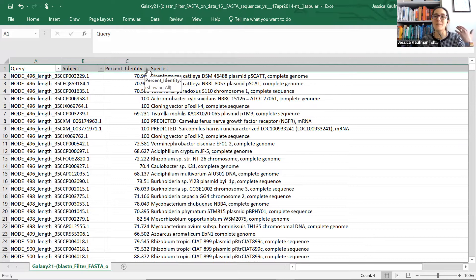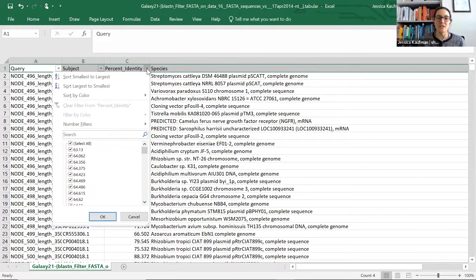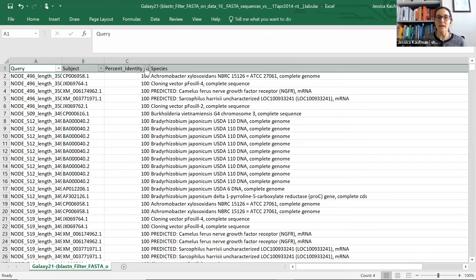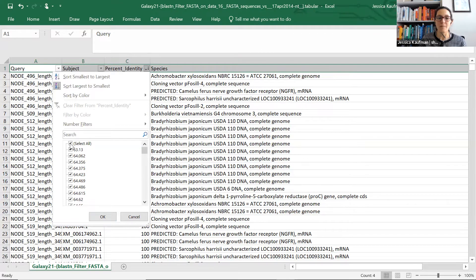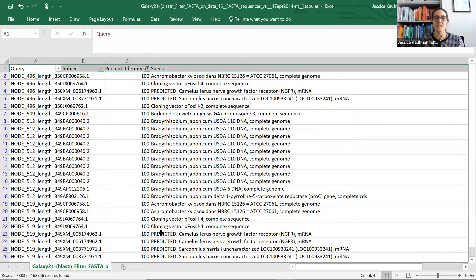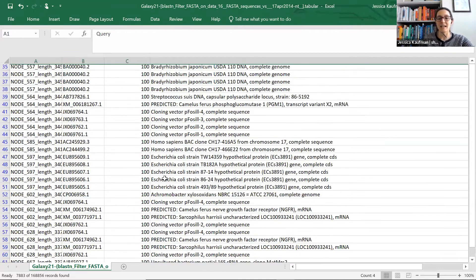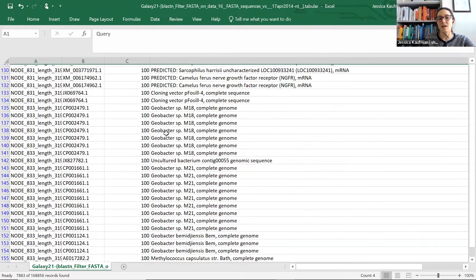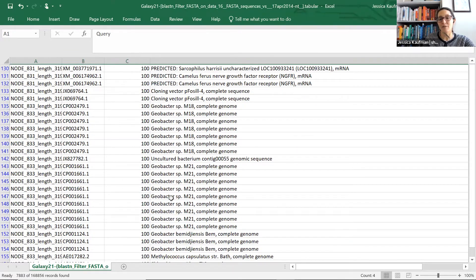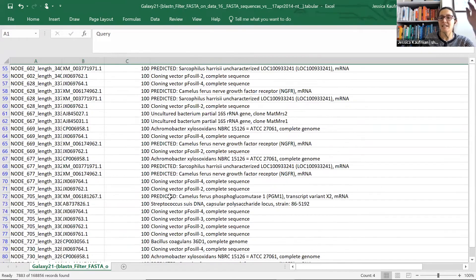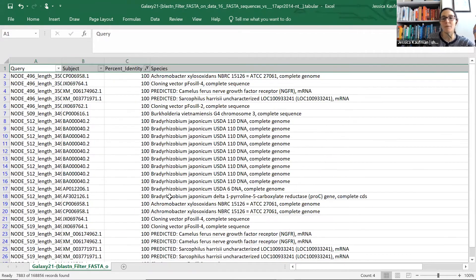The thing I really care about is what was the best result — what sequences actually have 100% identity? I can do that in a couple of ways: I can sort largest to smallest, or I can actually select from the pull-down menu only the rows that have 100% identity. Either way, I now have a list that I can look through. It's not too long, and a lot of the things that match are not perfect matches, but I can see a couple of species that come up multiple times.